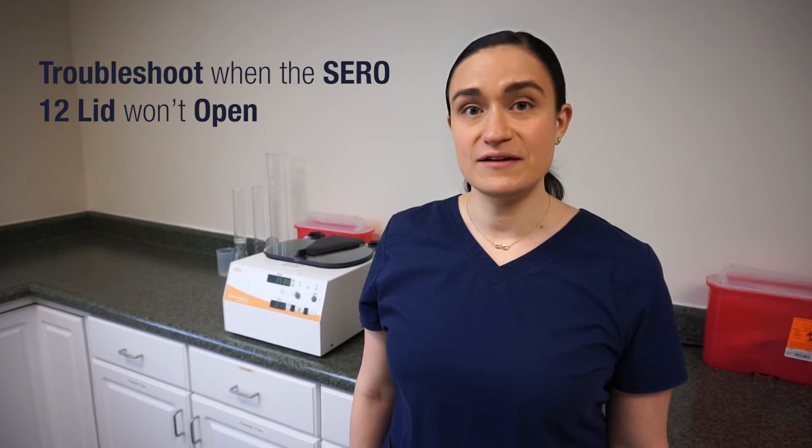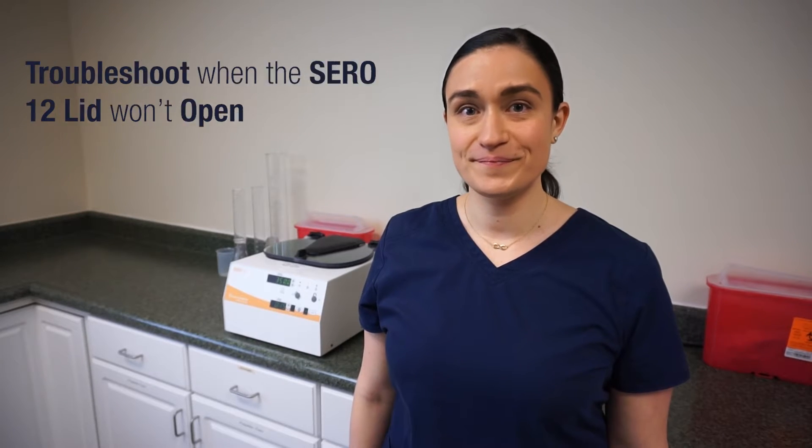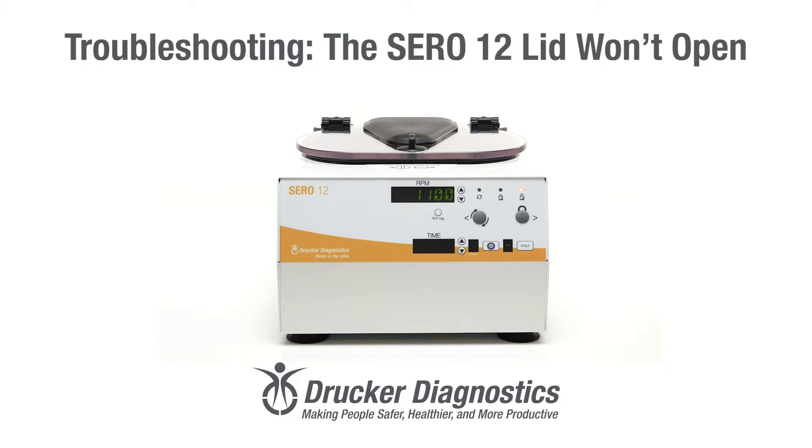Hi, I'm Dawn with Drucker Diagnostics and today we're going to troubleshoot when the Serro 12 lid won't open.